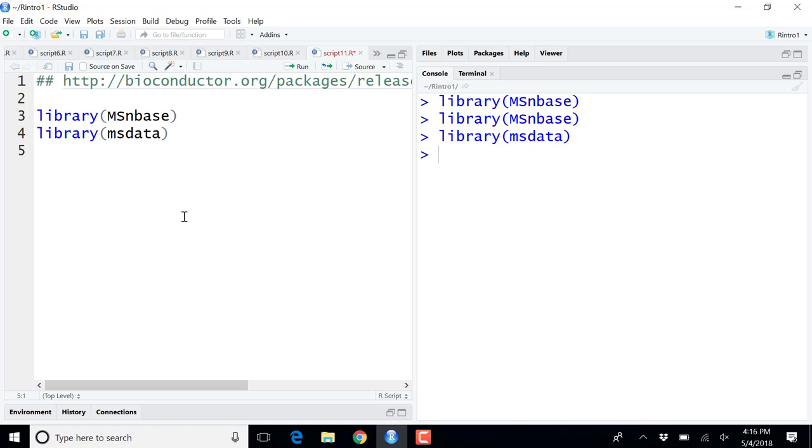Finally, are you familiar with mzTab? Is anyone familiar with mzTab? It hasn't taken on. If you have a spreadsheet with quantitative data as produced by MaxQuant, Proteome Discoverer, and so on, there is a generic function called readMSnSet. It's also a readMSnSet, but version 2 is easier to use. It will read that spreadsheet for you and create an MSnSet object. It's a type of object that is dedicated; it knows that your data contains quantitative information.